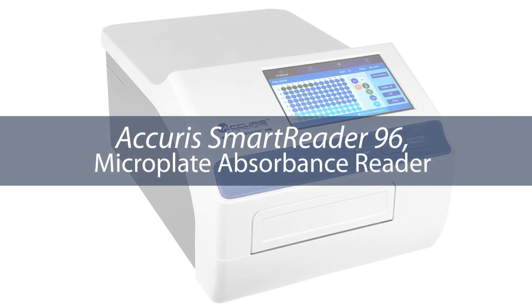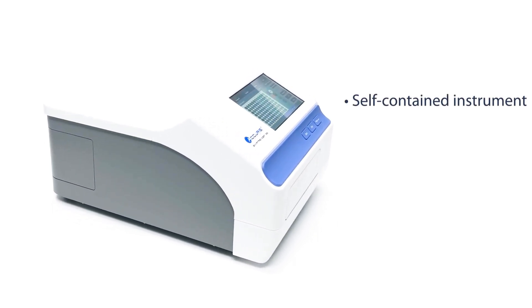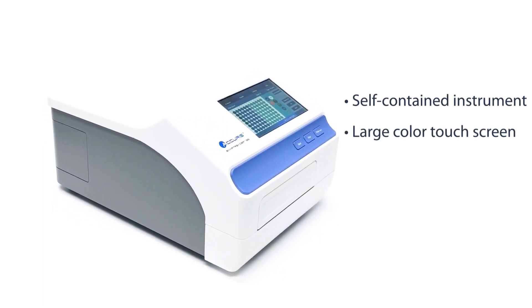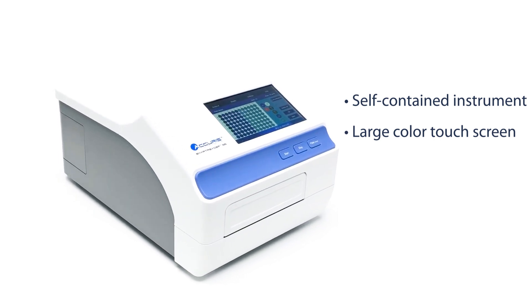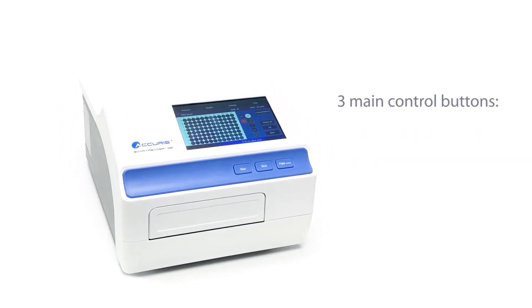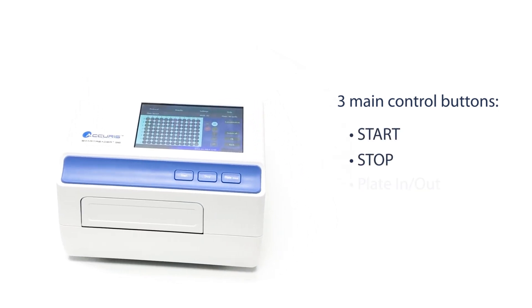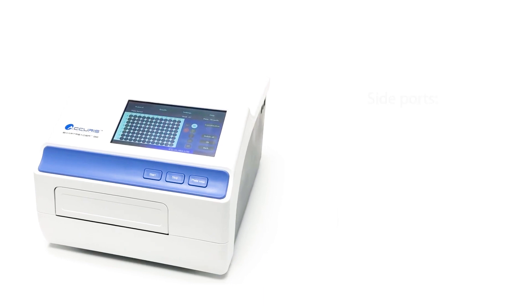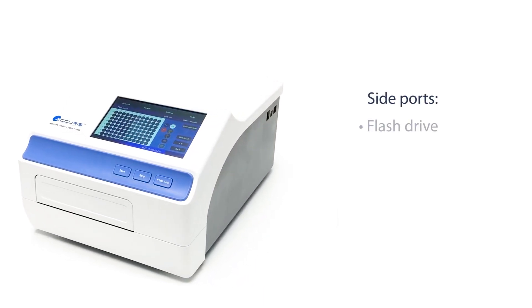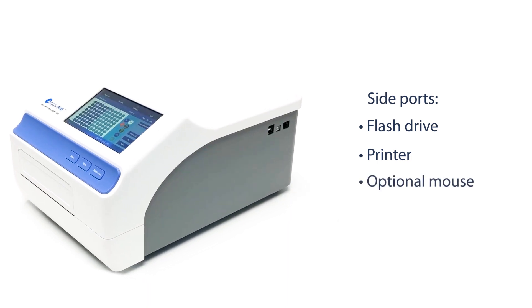Introducing the Accuris SmartReader 96 Microplate Absorbance Reader. The SmartReader 96 is a self-contained instrument that includes a large touchscreen control panel and built-in software, so no external computer is required. There are three main control buttons on the front panel to start and stop a plate reading and to open and close the motorized drawer. Side ports are available for connecting a flash drive to save data or to connect a thermal printer or an optional mouse.